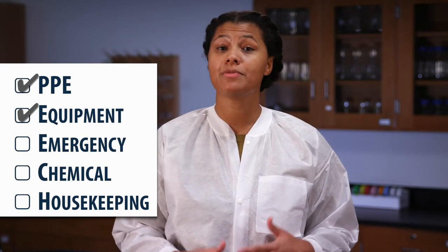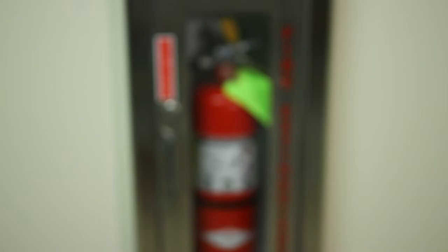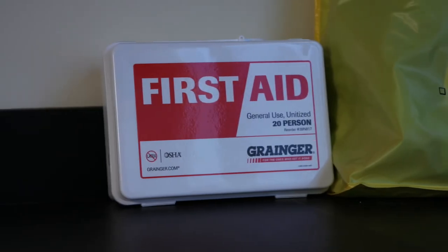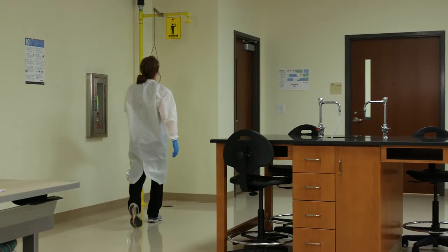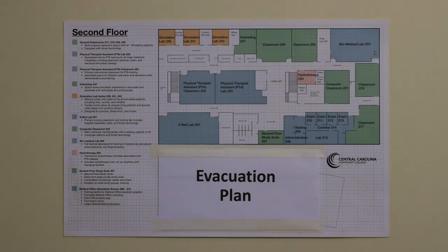Now let's look at some emergency gear. Know the location of your safety shower and eyewash station, fire extinguisher and first aid kit. These areas must be kept clear of obstacles so you can get to them fast. Safety equipment also has to be regularly inspected and tagged. Be familiar with the emergency evacuation plan — an exit should be clear and marked.